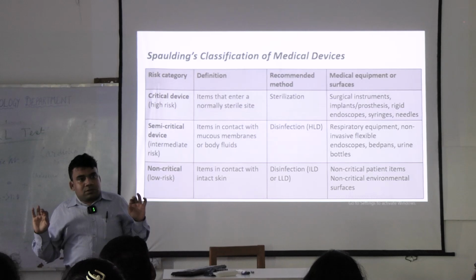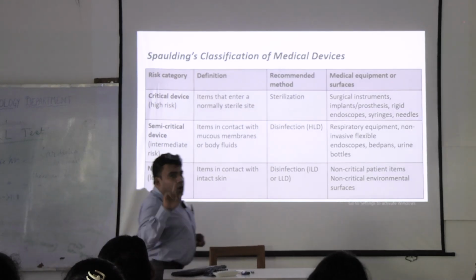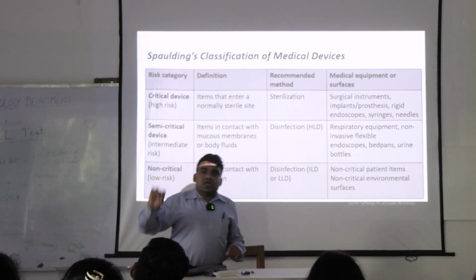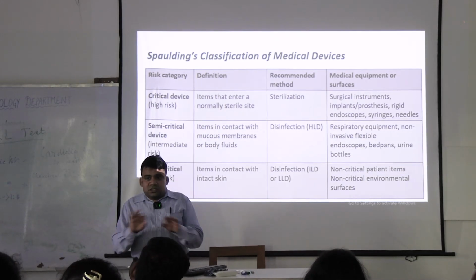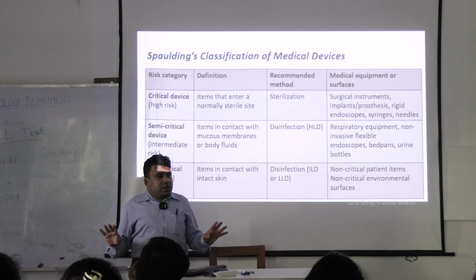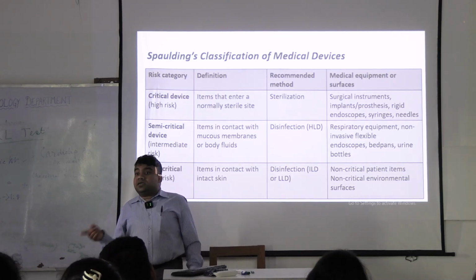Have you understood? When I have said that, now look back. All the syringes, needles, they are pre-sterilized. Once you open, you have contaminated it. You can't use it again because it is entering a sterile region.